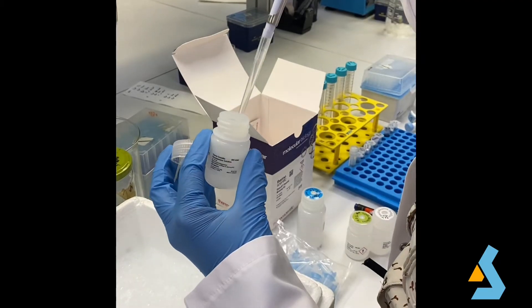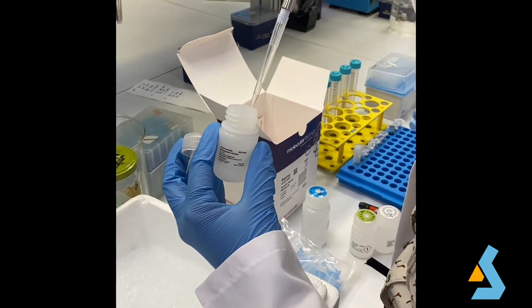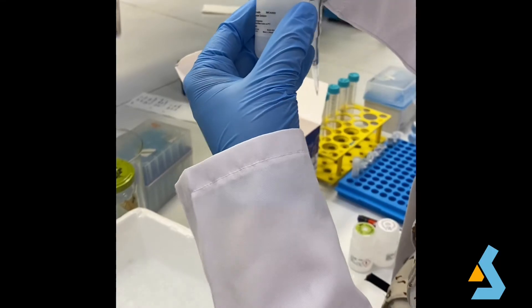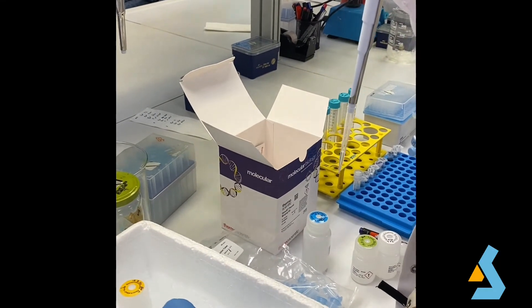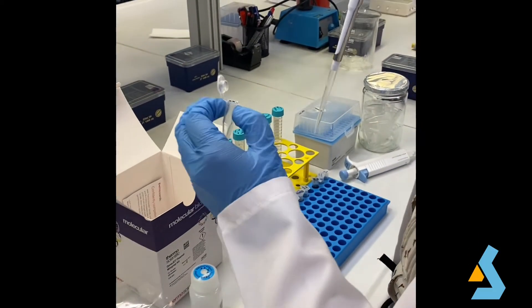After discarding the supernatant, pelleted cells are resuspended in 250 microliters of resuspension buffer. The cells should be resuspended completely by pipetting up and down until no visible cell clumps remain.